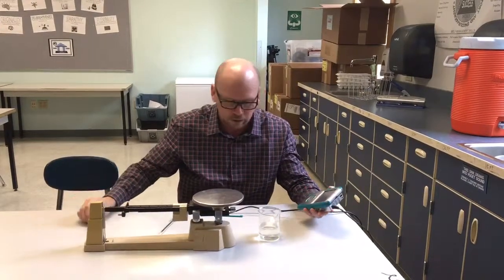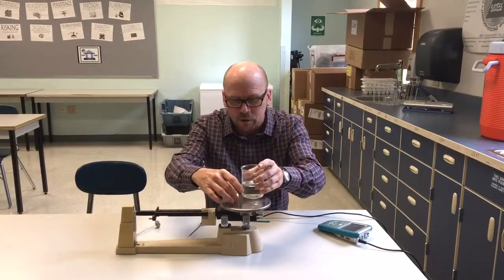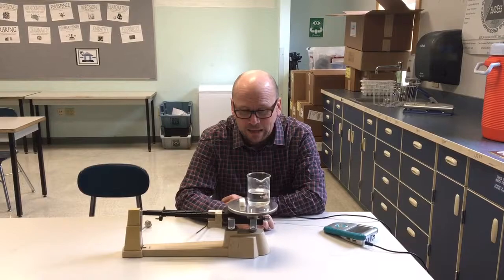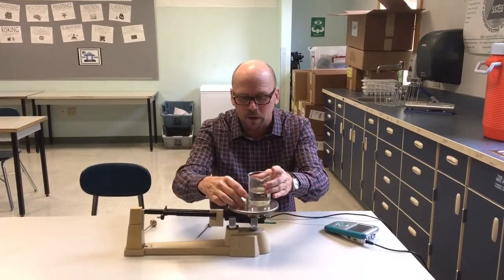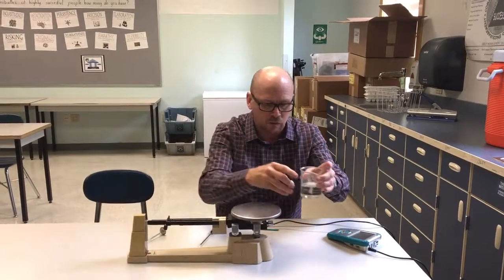They both work. At any rate, the first thing you need to do is take your water and your sugar cubes, find their mass, and record that mass. Then go ahead and pull these off the balance. You don't want to do this next part on the balance, and try to be careful not to grind your sugar cubes around because sugar will fall off of them.